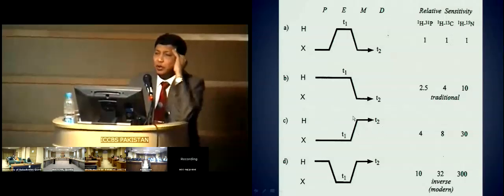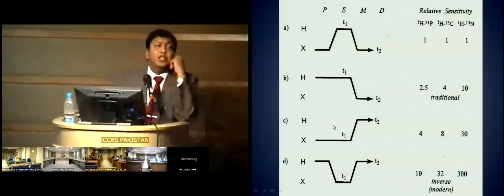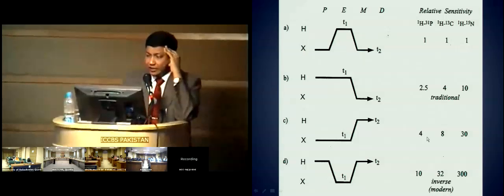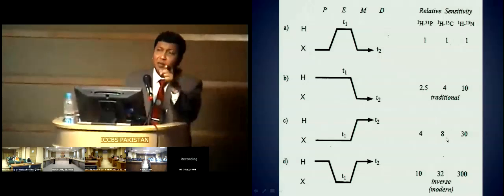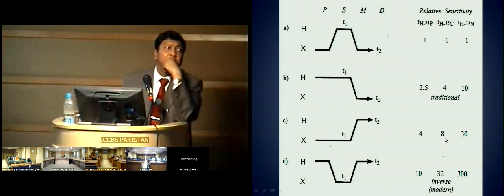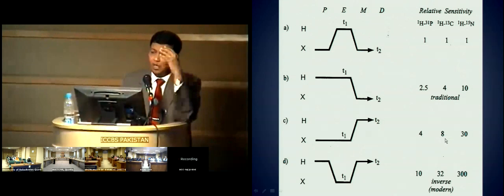Now you detect the proton, but this X is already labeled on proton. X information is now transferred to the proton, and this is an 8-fold increase. Now it is not an 8-fold increase in the carbon intensity, please kindly remember. This is 8-fold in comparison to a normal carbon spectrum.